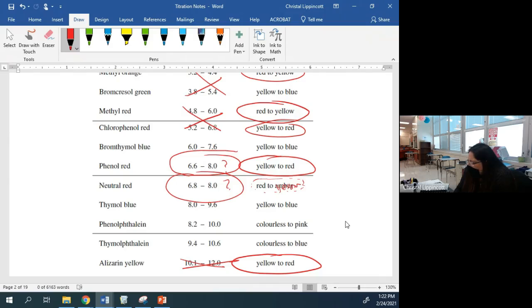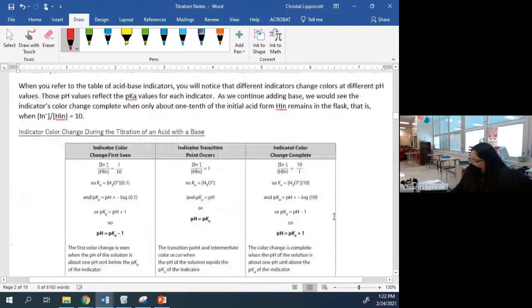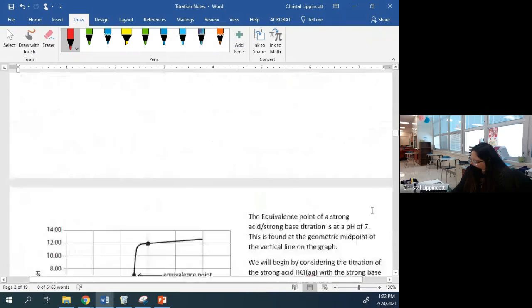Either one I guess would be fine. They said phenol red in the answer key, but I think either one of those would be fine. I didn't originally identify amber with yellow, but now that I think about it, that works out. So either one of those would be fine to grab off of the shelf in the back.